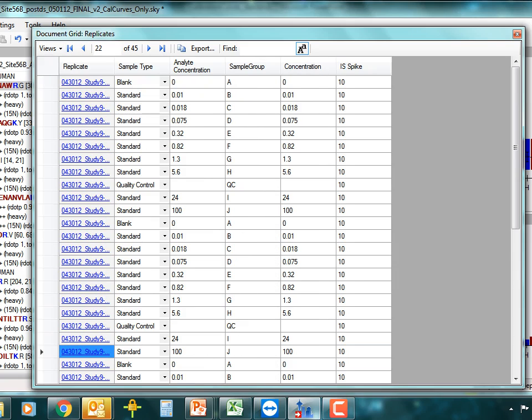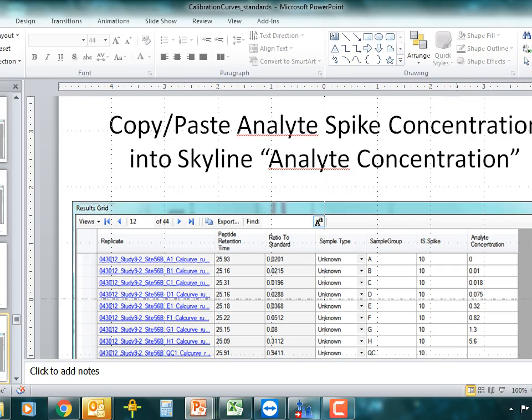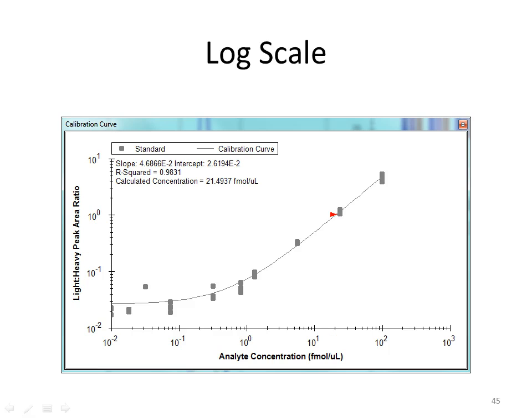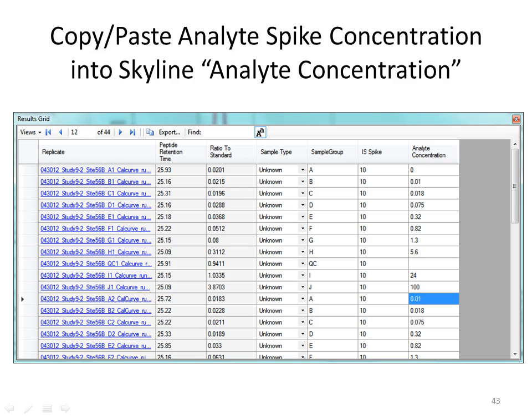Okay. So is everybody's table populated so far? Okay. So now we want to do the sample type, and I'm going to again just take you through the walkthrough section. Please use the documents grid instead of results. What you want to do next is identify the sample type in order for it to realize whether it's a standard or a blank or something that needs to be quantified.